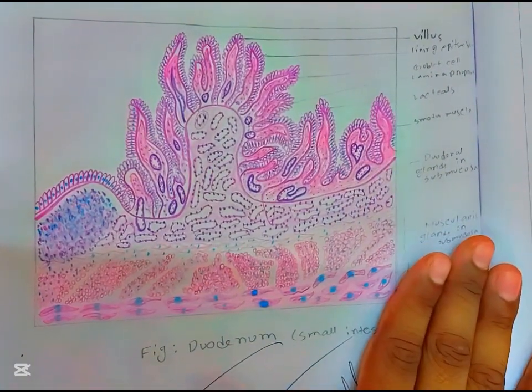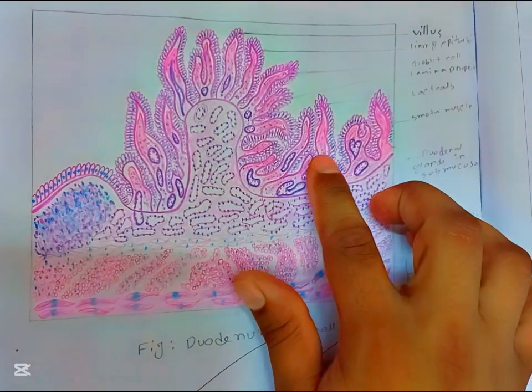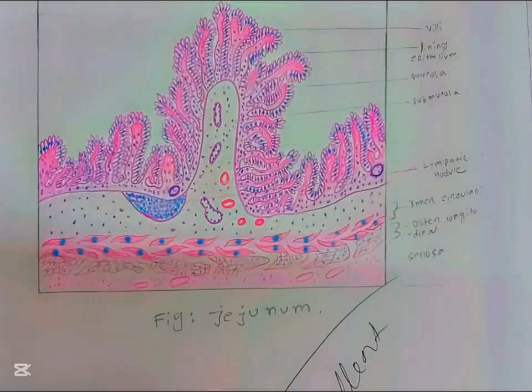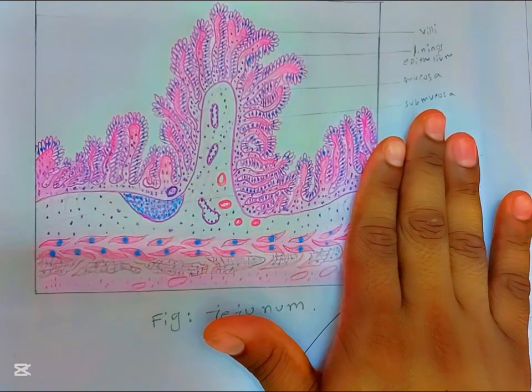This is the histological figure of duodenum, and the villi of the duodenum look tongue shaped. Then next is the histological figure of jejunum. This is the histological figure of jejunum.